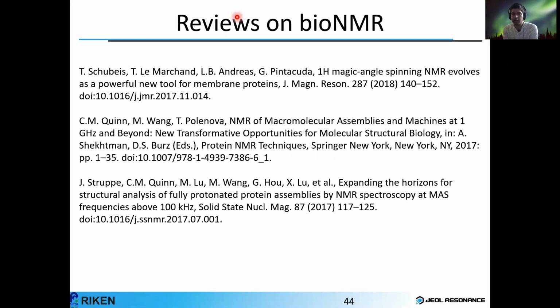Okay, so the next question from Raj, I think you touched upon some of these points. What are some examples of situations where it would be more advantageous or necessary to use slower MAS spinning frequencies? Okay, the slow spinning frequencies. Amorphous materials, when you have broadening due to heterogeneity, for example, in your polymers, there you would not really benefit from spinning faster, because it's the other side of broadening.